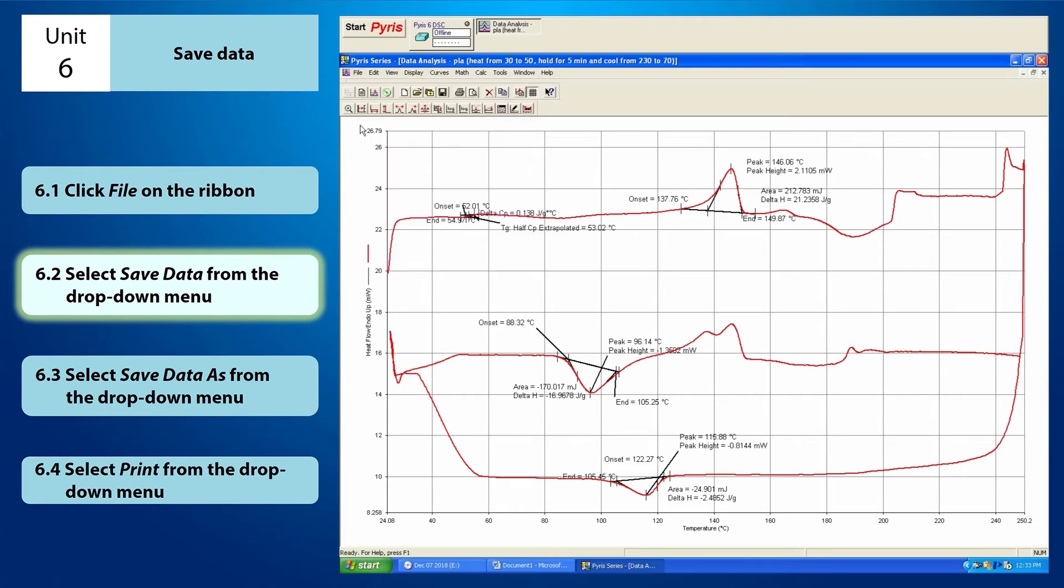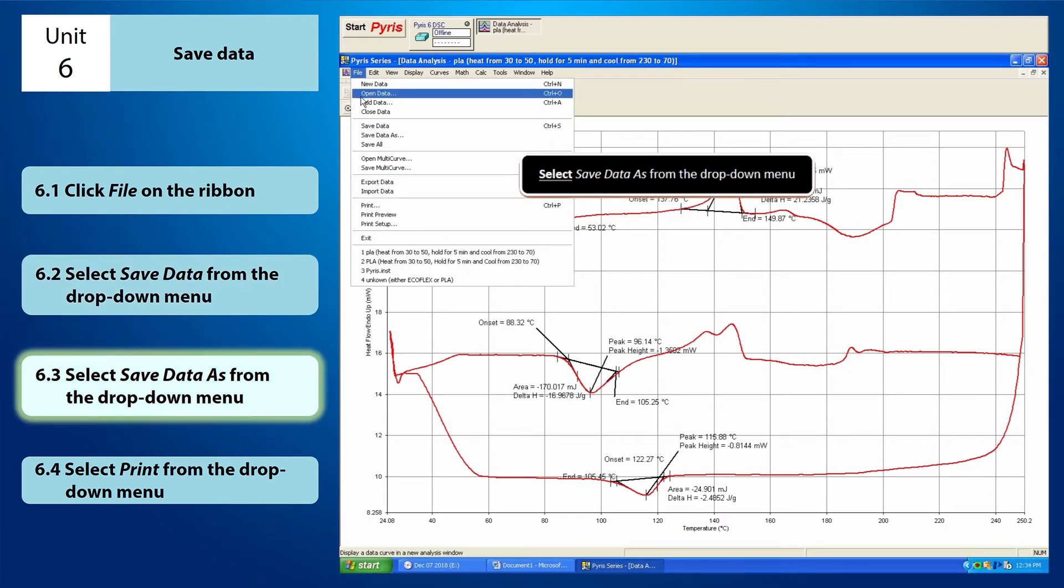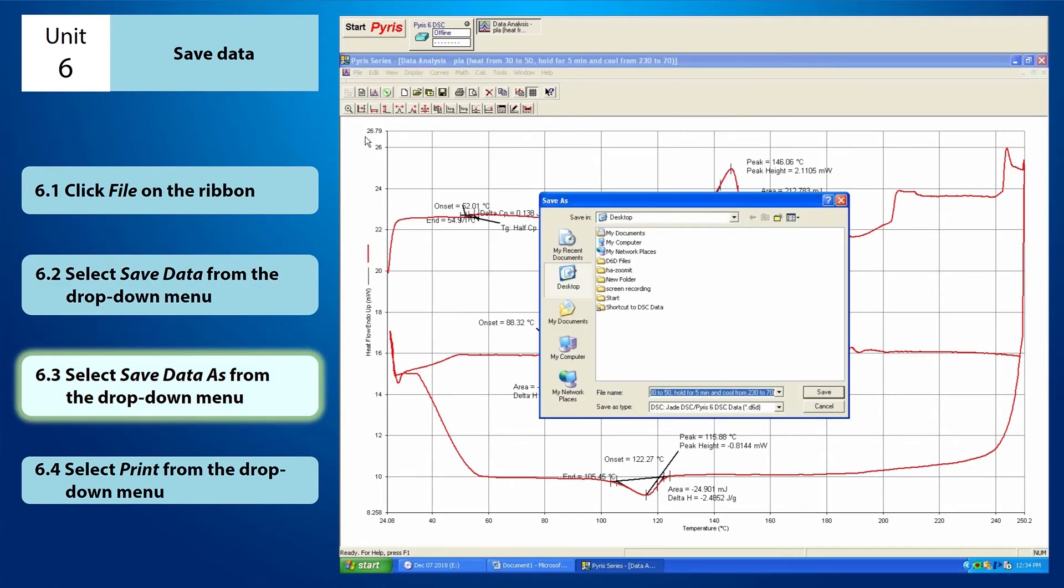If your answer is no, you do not want to rewrite the previous data, you want to save another copy of D6D file, then you have to select save data as from the drop-down menu of file. Select the destination folder you want to save the new D6D file.